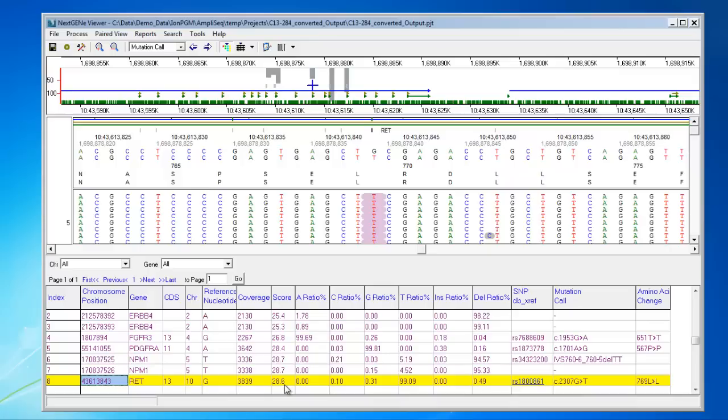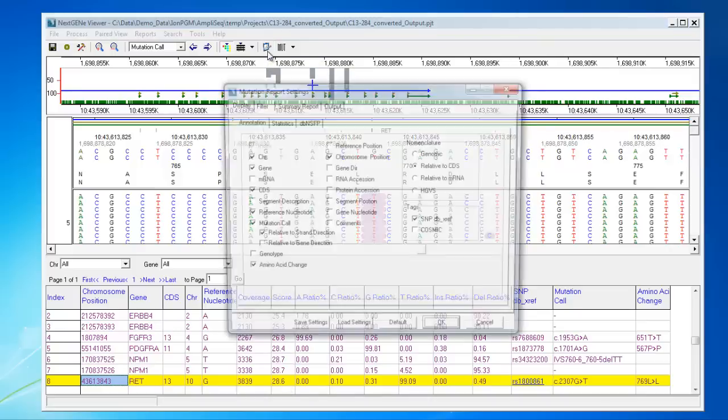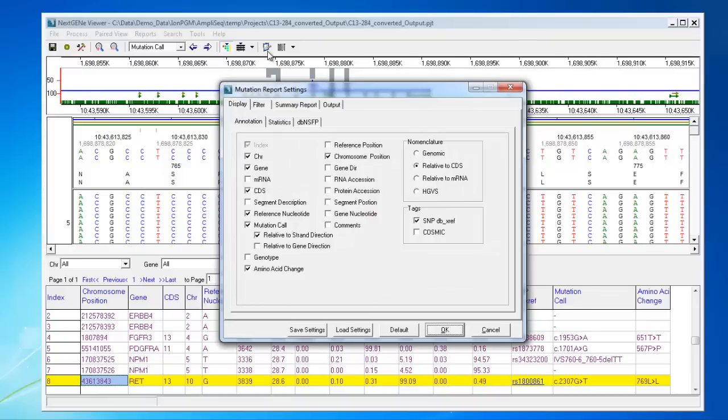The mutation report is very flexible, allowing you to modify the display, as well as filtering which variants are included in the report. To edit these settings, you can click on this icon to open the mutation report settings. On the display tab, there are several sub-tabs which you can use to select which columns of information to display.